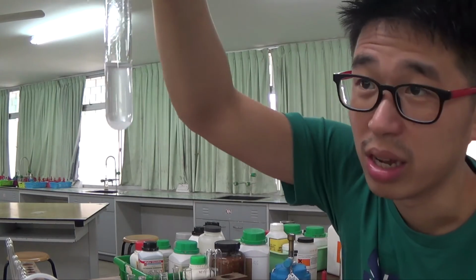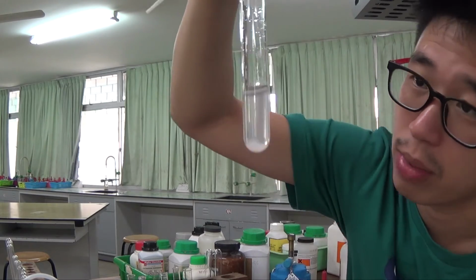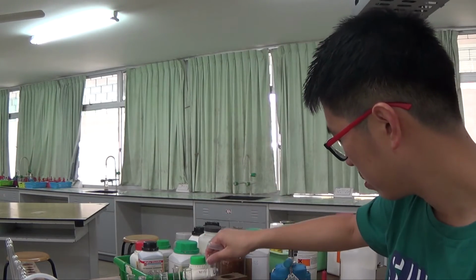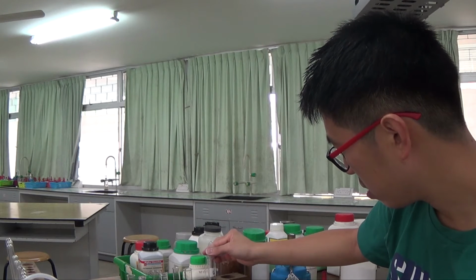So at the moment you see the solution is a bit cloudy-ish, but there's a very fine solid that's settled at the bottom. So not very soluble at all. But I think it should prove my point.